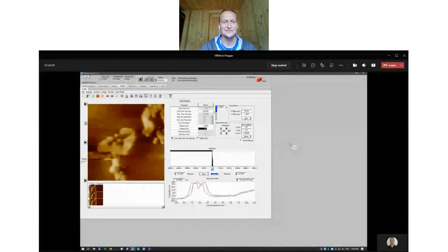So I'm Yaroslav. I'm working as an application scientist for Bruker Hysitron products. I'm based in Prague. I have my demo lab with a tribo indenter, so I'm running samples for customers. I'm also demonstrating the instrument and doing the application support for our customer base. I'll have a short time to demonstrate the basic capabilities of a tribo indenter. A tribo indenter is a standalone platform system that can do in situ SPM images, indentation, and scratch tests. I'm going to demonstrate the combination of scanning probe microscopy and indentation, and also do a map over a sample area.